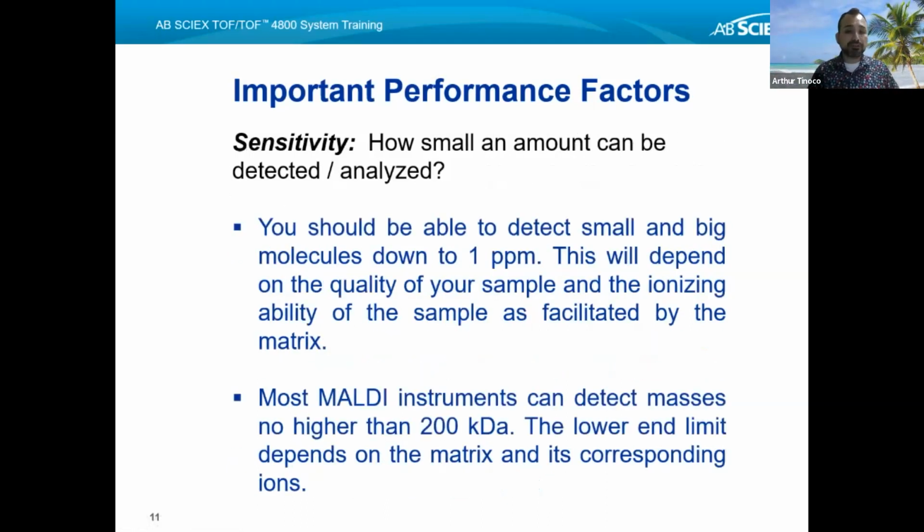And in terms of sensitivity, whether you're collecting data for small molecules or for big molecules, mass spectrometry is quite sensitive. With this instrument, because of the repeated use, I would say that our sensitivity is about 1 ppm. Again, small, big molecule, doesn't matter.